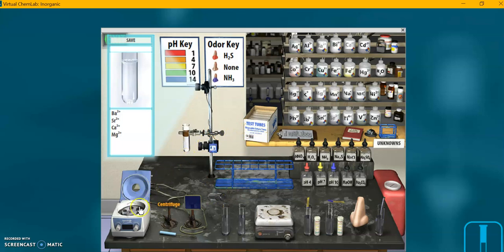We've got a bunch of items down here that we can use. Centrifuge, which you activate just by clicking on it. You've got a flame, flame test, flame test with a cobalt glass plate in the way of the flame so that you can see the colors differently.